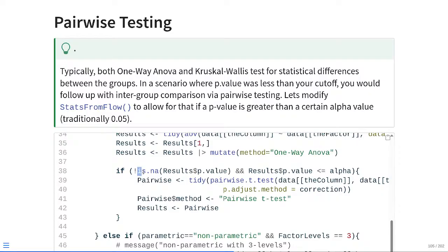So if this did return to us as a character value, this portion of the code right here would come back as true, in which case we actually are interested in a situation where it's coming back as false, meaning it's just a numeric. So we can use the little exclamation sign, as we've seen in the past, to flip the condition at that point, making it the opposite.